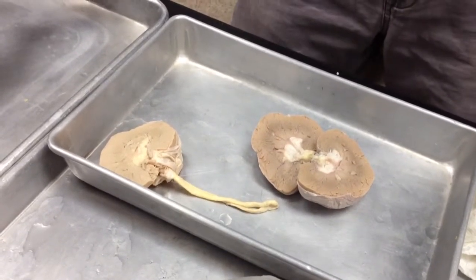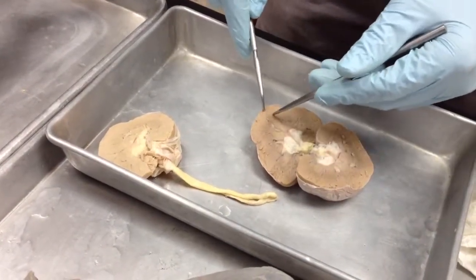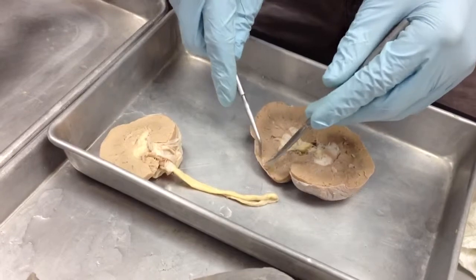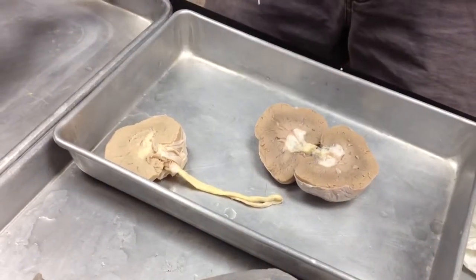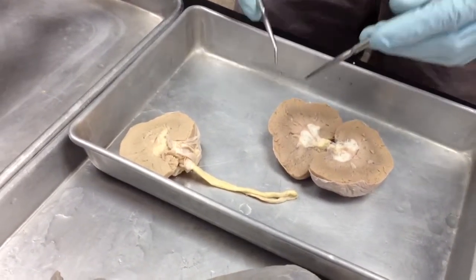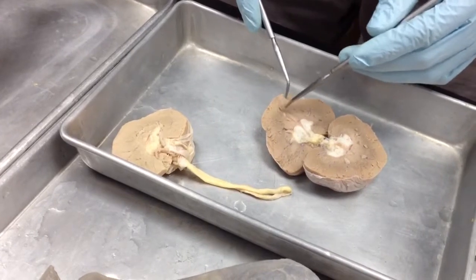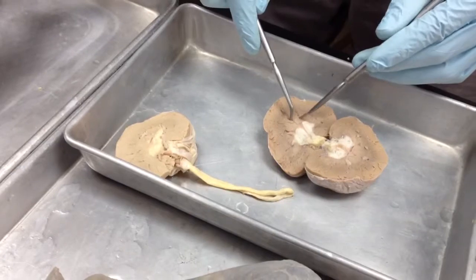That description I gave you of the nephron, the Bowman's capsule, and the majority of what's going on is out here in this renal cortex area. So you have veins and arteries entering into it, and they branch off and branch off and branch off, and you've got small little arterioles that run through the cortex. That's where you have the Bowman's capsule, part of that nephron, and that's where blood is being filtered. It goes down the proximal convoluted and distal tubes, which I'm not entirely sure about, but somewhere between the transition of the medulla and the cortex, and eventually they go into the pyramid.